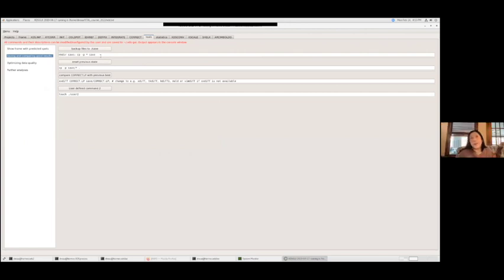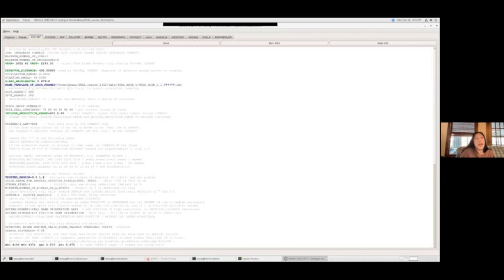And one final thing, you noticed that when David talked about rolling off the crystal, he just talked about truncating the data set at 480 and not taking everything after. XDS doesn't allow you to skip frames in the middle and process them all together. If you wanted, let's say, the first 500 frames and the last 50 frames as a data set, you would actually have to process them as 2 separate batches.